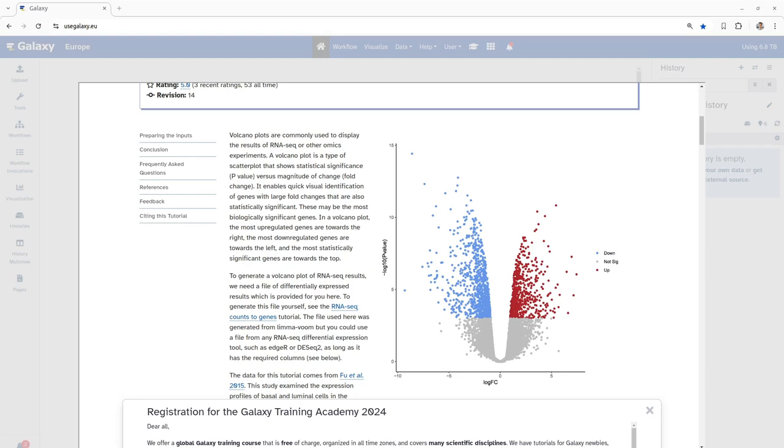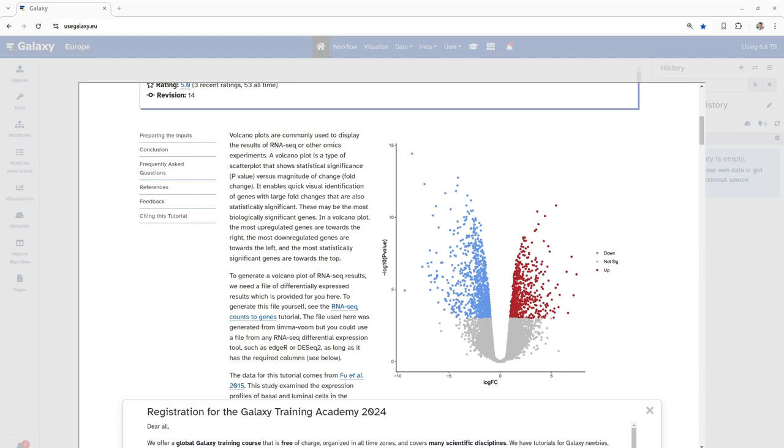As you can see in the adjoining figure, on a volcano plot the x-axis represents the fold change in gene expression. Genes that are upregulated or more active are displayed to the right while downregulated or less active genes are shown to the left. The y-axis represents statistical significance. Genes with higher significance are always positioned towards the top.